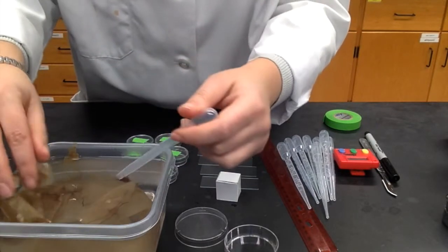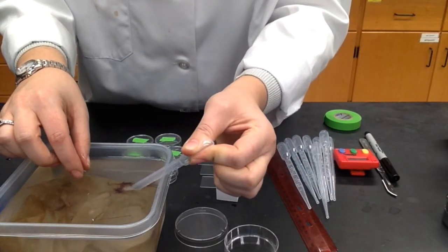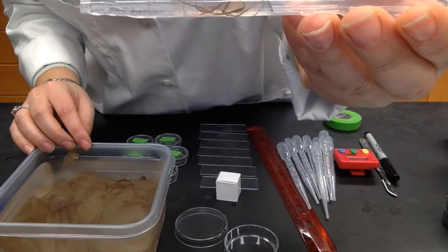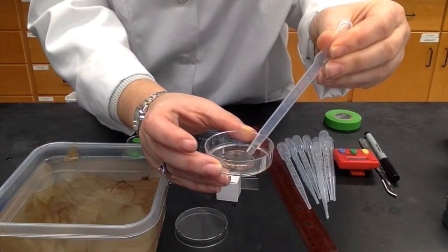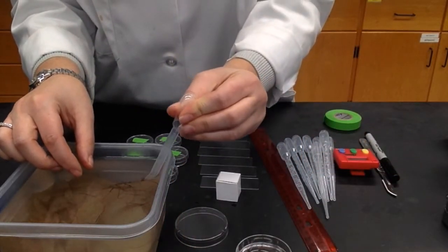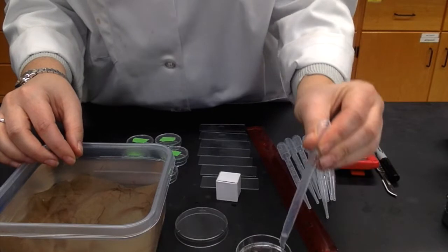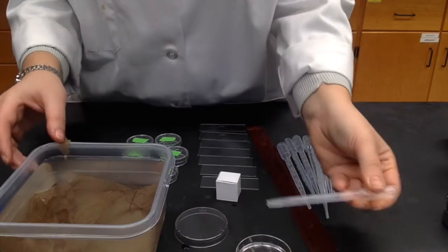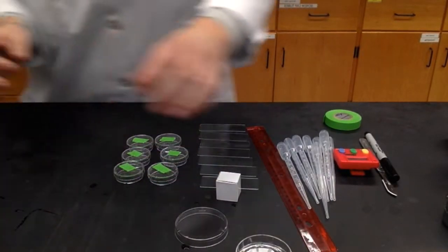The worms like to congregate in groups. Once you find a nice group of worms, press the pipette and suck up the worms into the transfer pipette. Once you have the worms inside the transfer pipette, you can transfer them to your larger dish. You'll need at least 5 worms to be held in this container, so repeat that until you have 5 worms. Once you have the worms, close the lid and return it to its station.